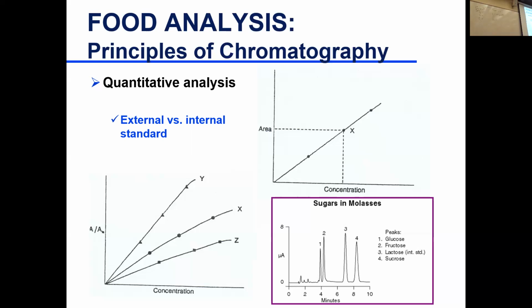So there's no reason that we have to use an internal standard by itself. If you're not after quantification, there's really no need to use an internal standard. Okay, but I'm saying we would never use an internal standard without an external. Without quantification, sometimes you use an internal standard just to check that your sample preparation is accurate and you're not losing your compounds during preparation.